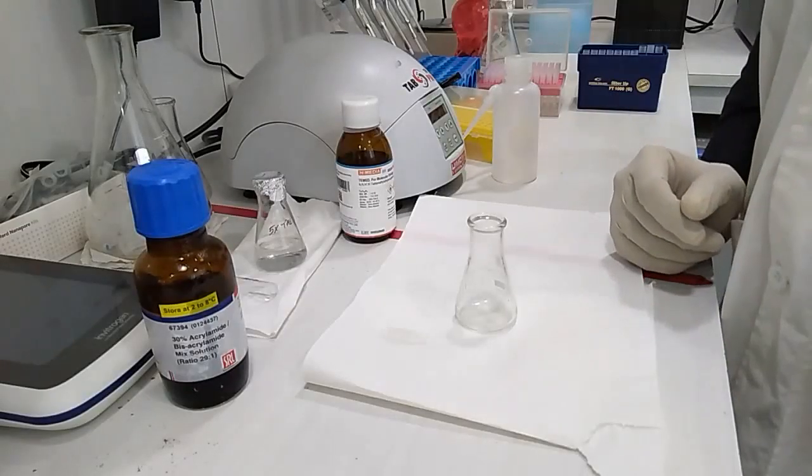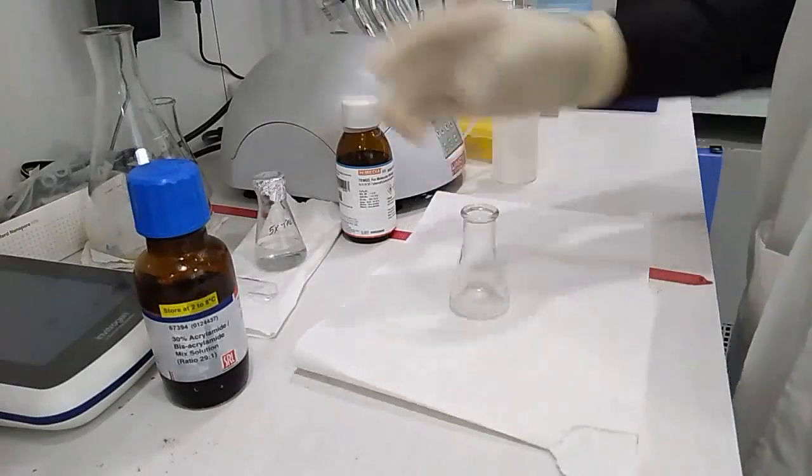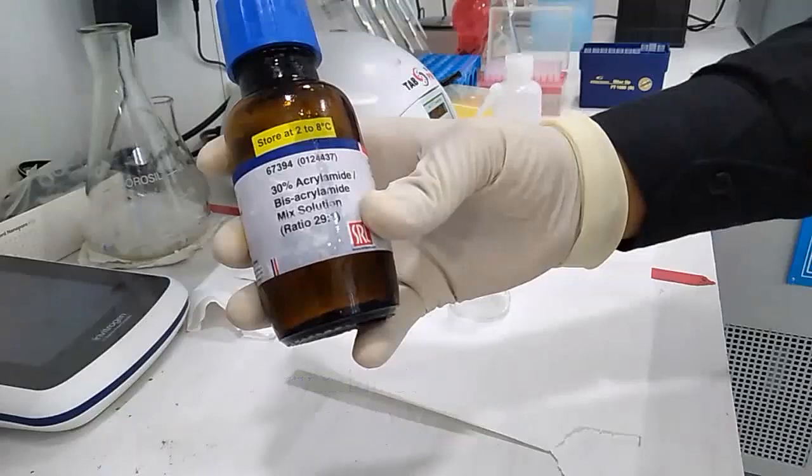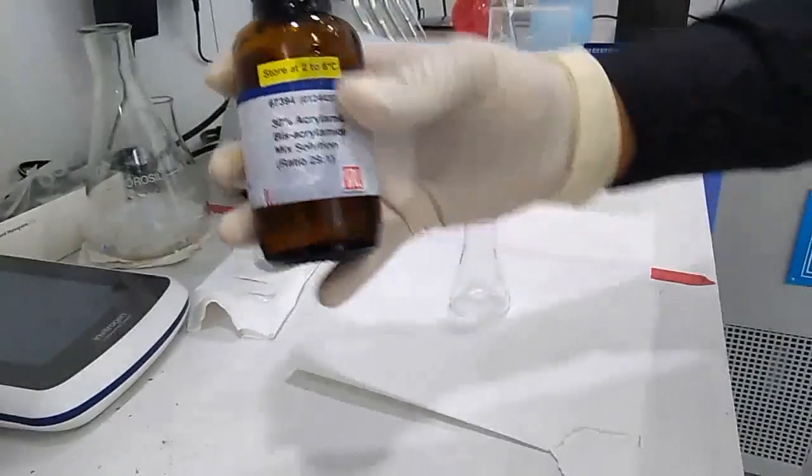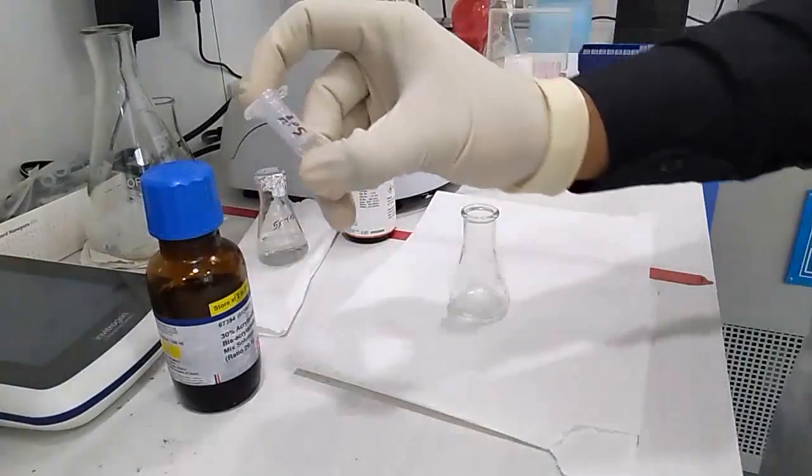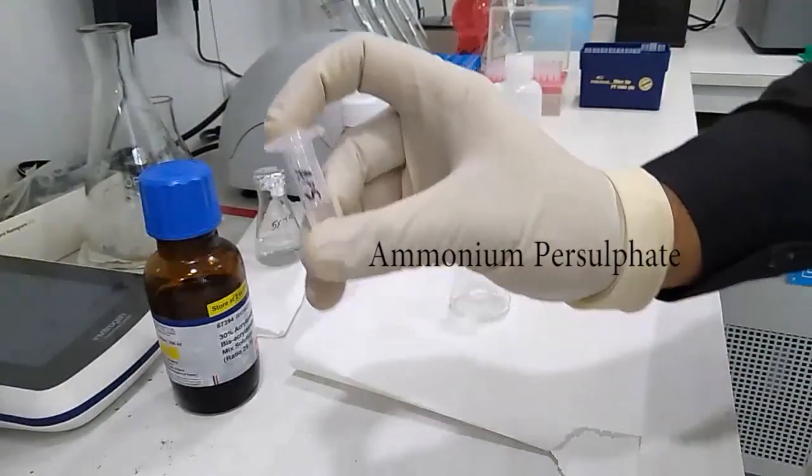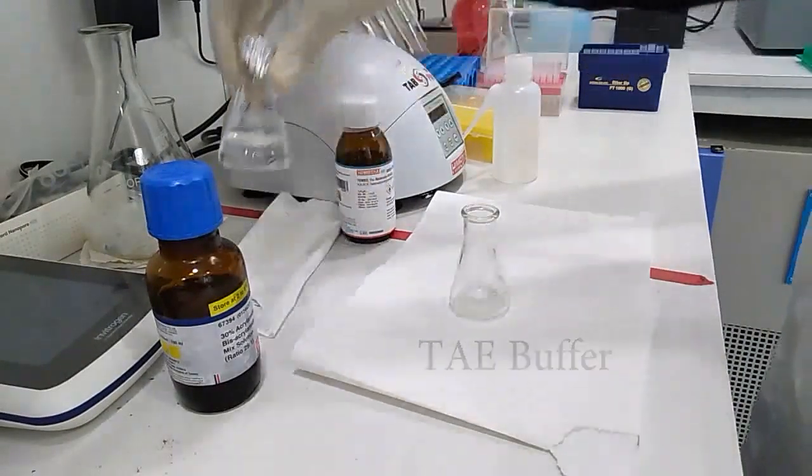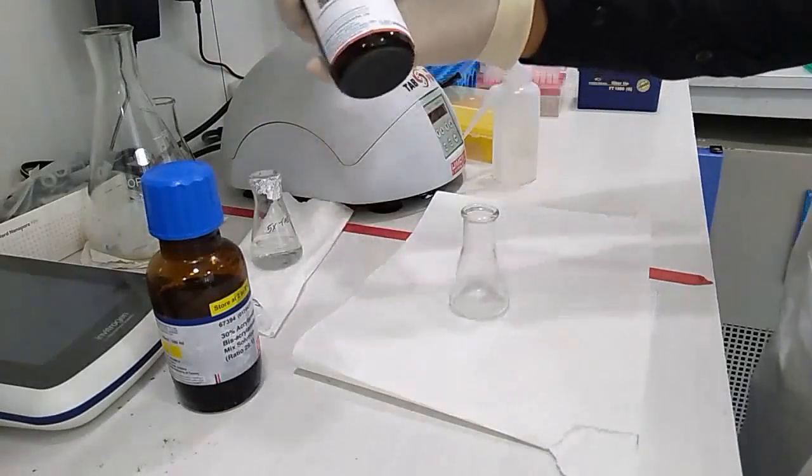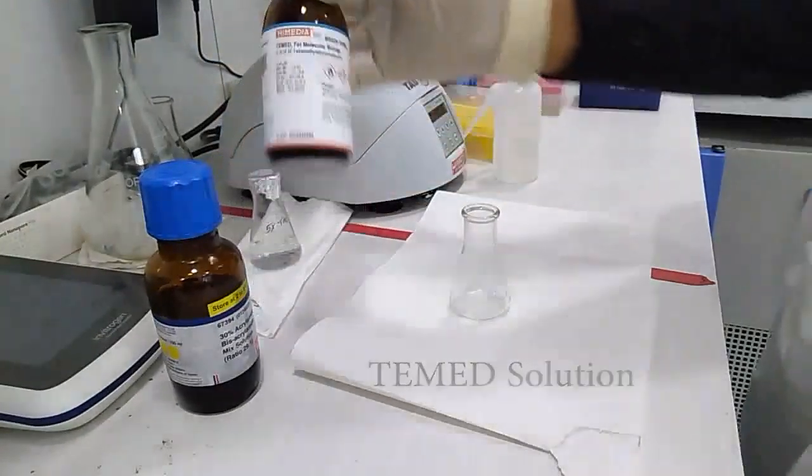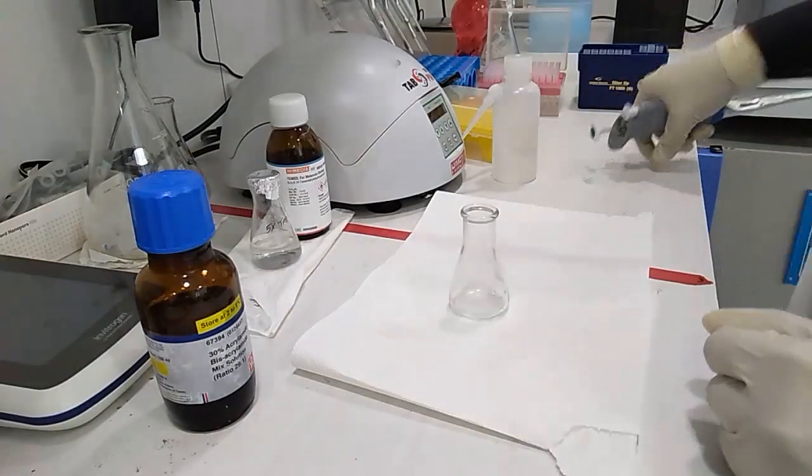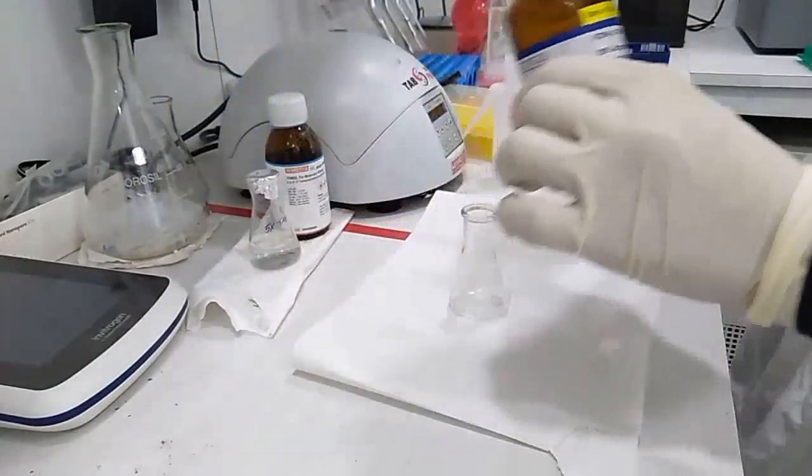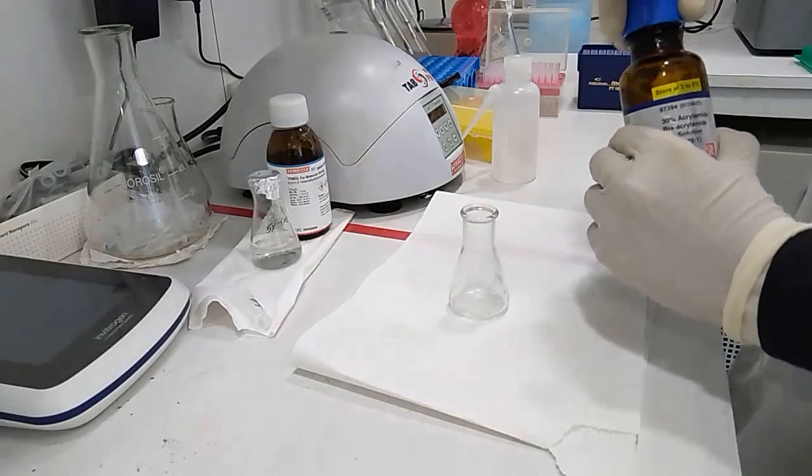This is the time for making polyacrylamide gel solution. For this we need 30% acrylamide bis-acrylamide mix solution 29 is to 1. We need APS ammonium persulfate solution which was solute before. We need 5x TAE and finally we need TEMED. So at first we need to give the acrylamide and bis-acrylamide solution mix in 29 is to 1 ratio.